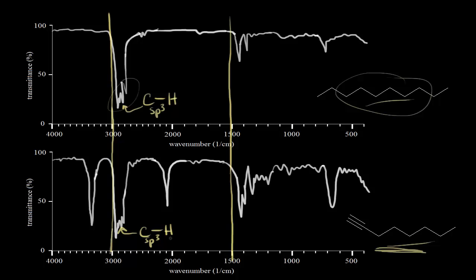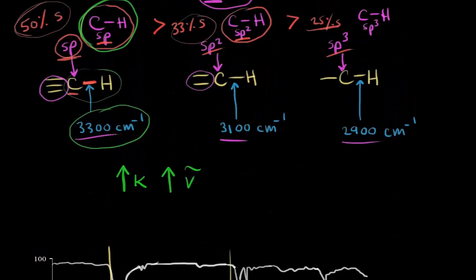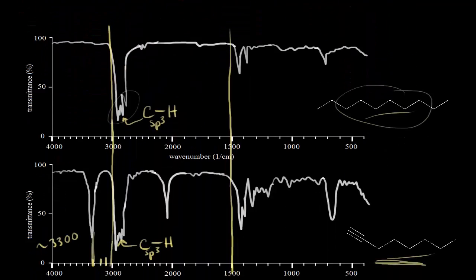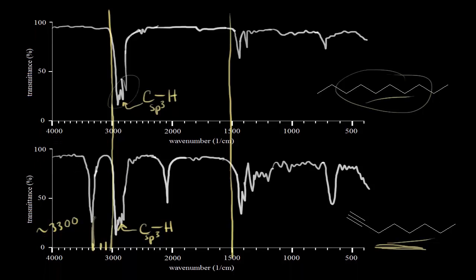Once you draw that line at 3,000, you can see differences. In the 1-octyne spectrum, there's a signal that, when we drop down, is pretty close to 3,300 wave numbers — about 3,100, 3,200, 3,300. So approximately 3,300 wave numbers. We can go back to our earlier analysis and confirm that 3,300 is where we expect to see the C-H bond stretch where the carbon is sp-hybridized.